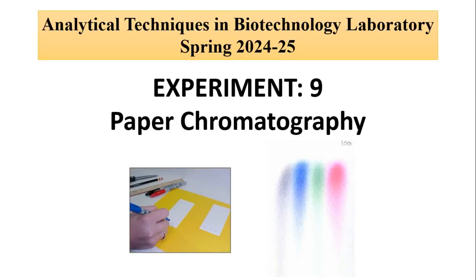So today in the practical class we'll learn how we can use the technique of paper chromatography. As we know, chromatography stands for separation of compounds from mixtures. Chromo means color and graphy means to visualize or to understand the observations. In this particular technique, we take paper as the base material.